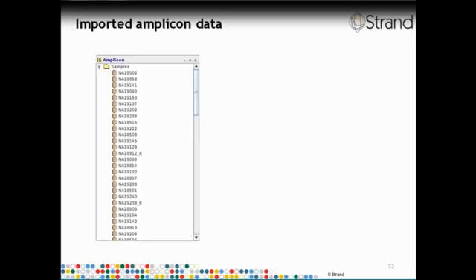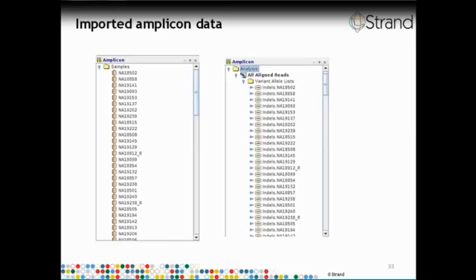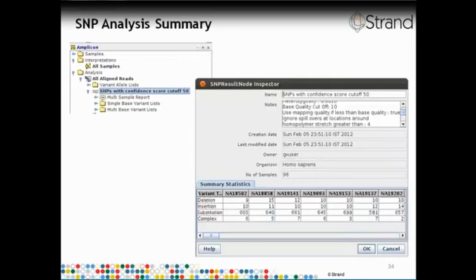We are interested in high confidence variant alleles, that is, alleles which have a reasonable amount of coverage in a sample and which have a very low strand bias. Those are what we would call high confidence alleles. In addition, we are interested in identifying high confidence alleles which are common across a lot of the samples. We may also be interested in high confidence alleles which are occurring only in some of the samples. And in the case of cancer sequencing, we may be interested in low frequency mutations. All of these workflow steps are possible through the Find Significant SNPs workflow.